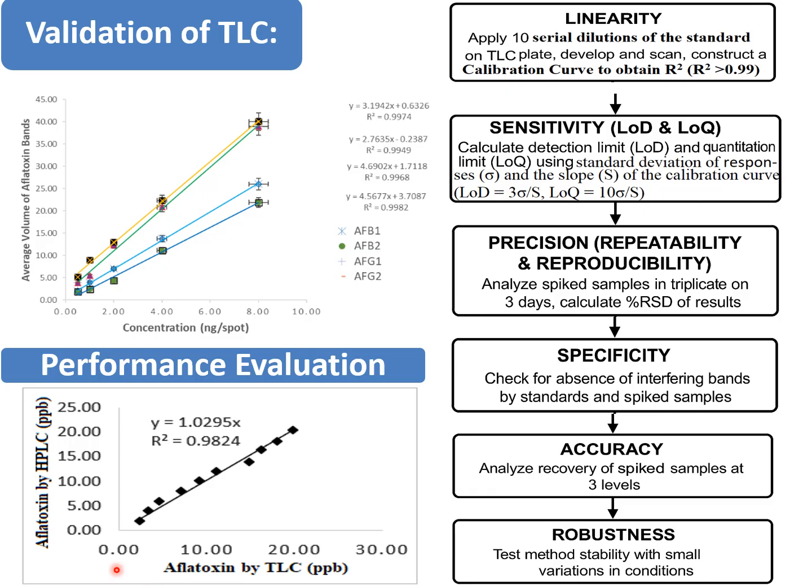This comparison is usually done by plotting a calibration curve of the concentrations measured using the developed method versus the concentration measured using the gold standard method to produce a straight line calibration curve that must pass through the origin.